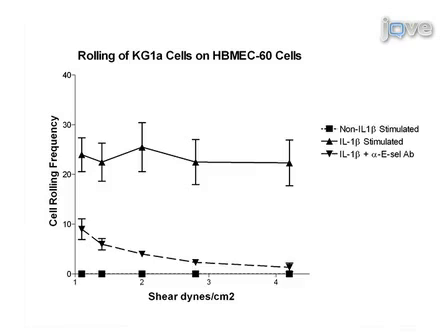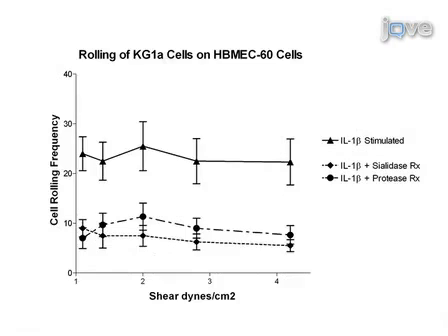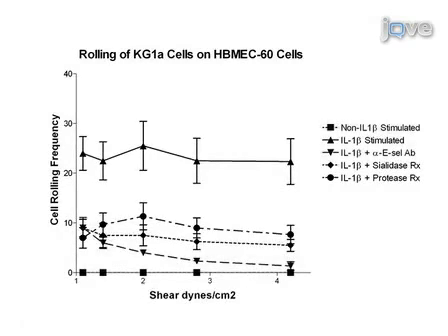This assay can be used to test other parameters as well. For example, when stimulated cells are pre-treated with a sialidase or with bromelain, the results are less robust. These data highlight the importance of terminal sialic acid residues, as well as cell surface glycoproteins, for E-Selectin ligand activity.